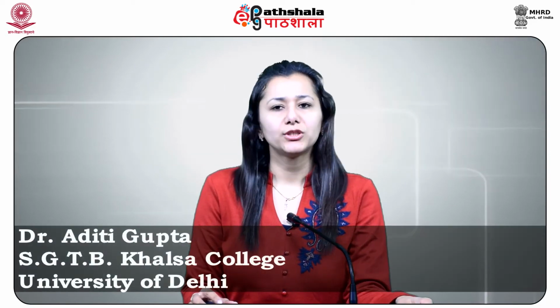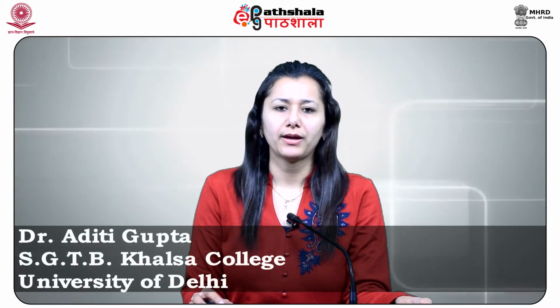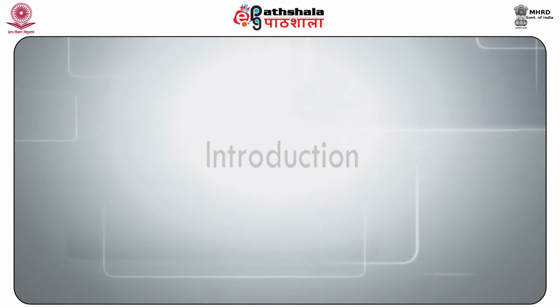After studying this module, you shall be able to know about the basic introduction of flame photometry, the development of flame photometry, the principle and working of flame photometry, and its applications and limitations.